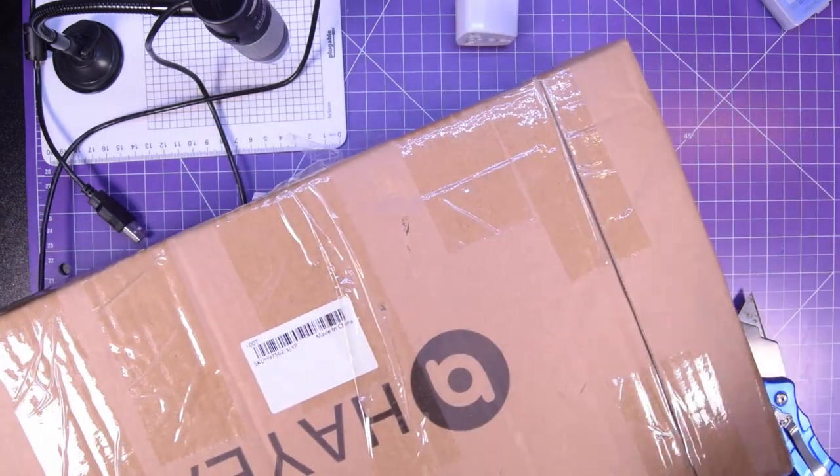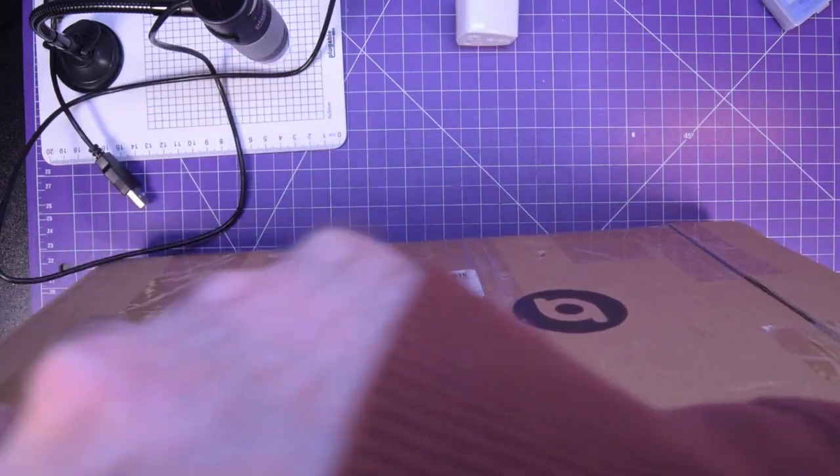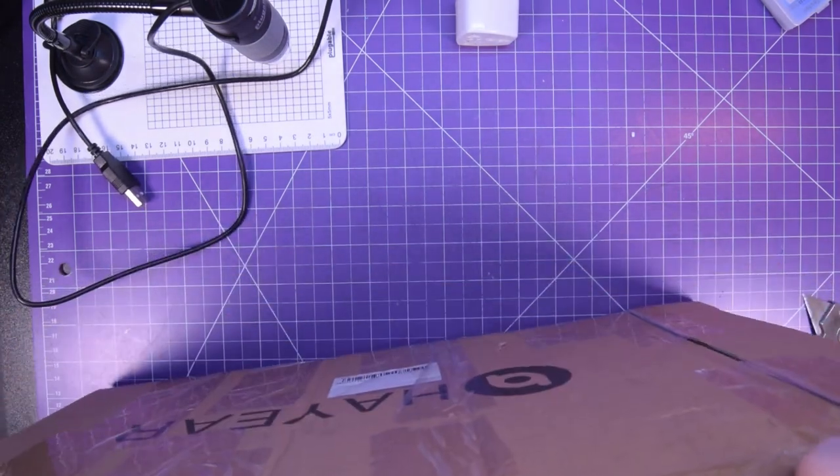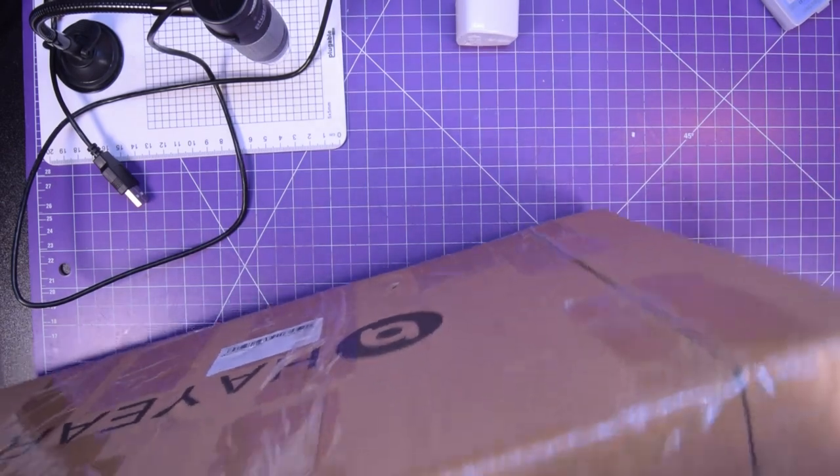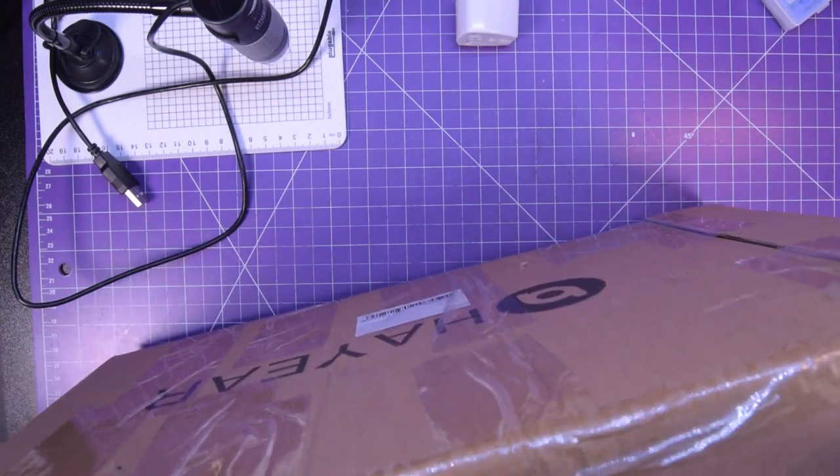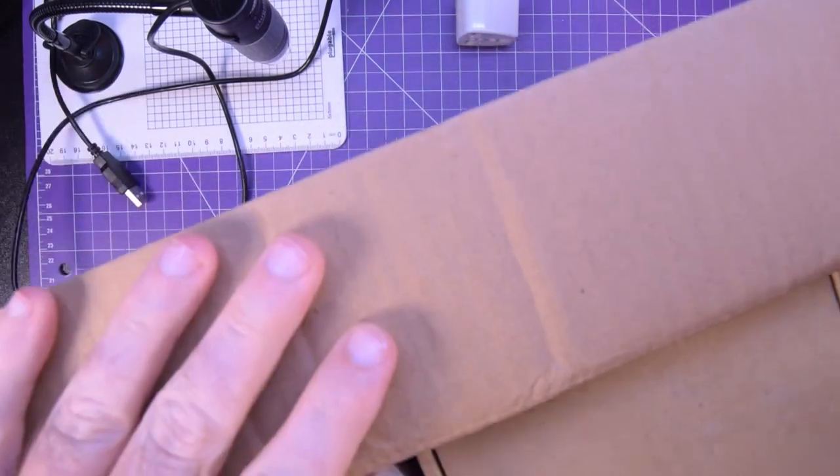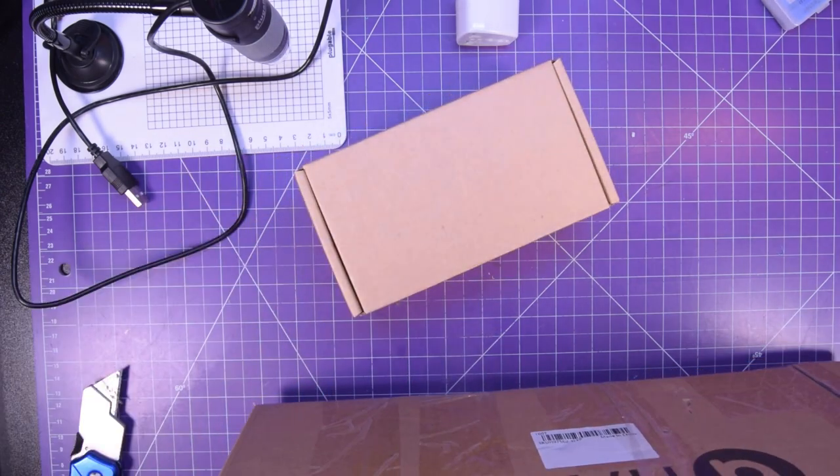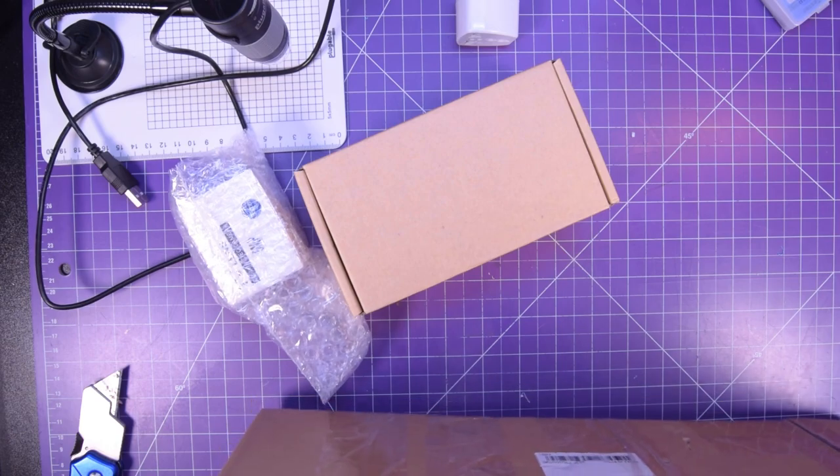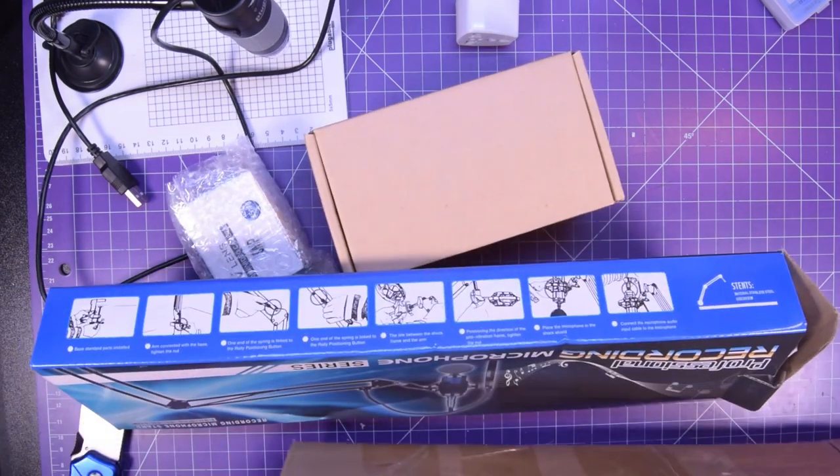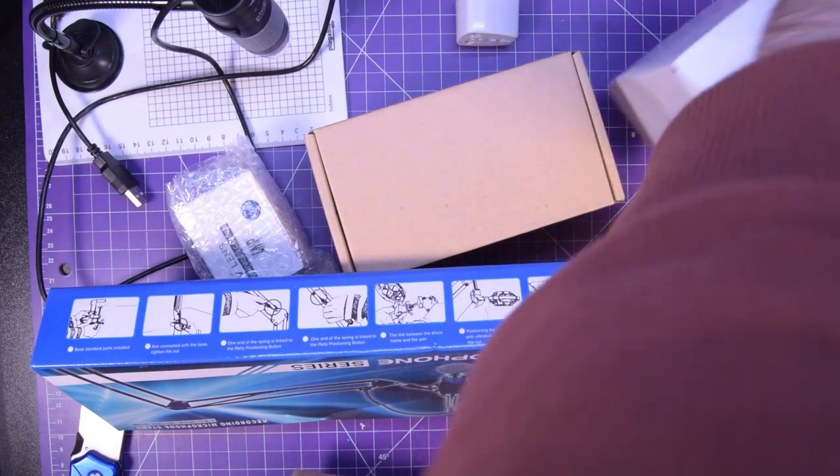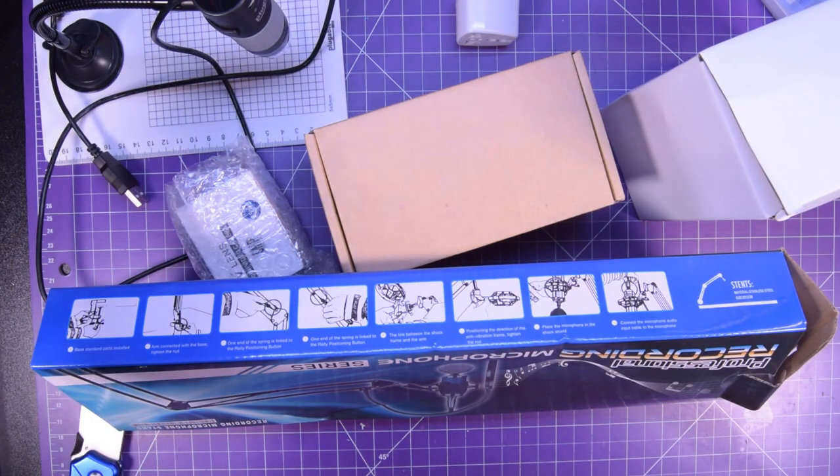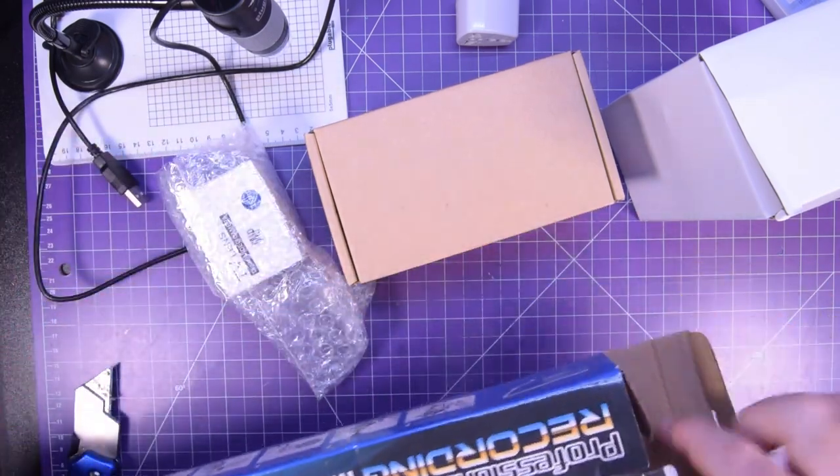So these things, I'll have to explain why I wanted this, but the first thing is I'm going to have to see it myself. Because this is being recorded before I've actually seen it. The thumbnail gets taken towards the end of the video. So let's see what's inside here. We've got a box.